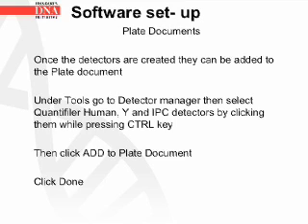Once the detectors are created, they can then be added to the plate document. Under Tools, go to Detector Manager, then select the Quantifiler Human, Y, and IPC detectors by clicking them while pressing the Control key. Then click Add to Plate Document. After, click Done.